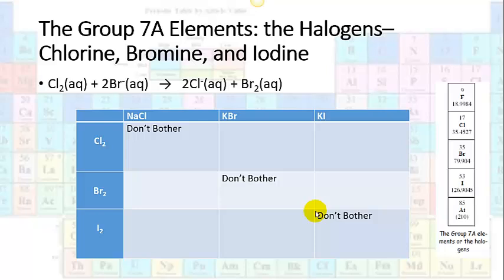So you will follow through with all of the different types of reactions that you see in your lab and follow along with your lab report form. When you get to the reactions of the halogens, I just want to point these out. I'm not going to go through each and every one. You're going to be able to determine the reactivity through your observations, but the halogens are tricky for folks. So I want to just spend a few minutes on what it is we're looking for and how you interpret what you see. So we're looking at chlorine, bromine, and iodine, and we're comparing the reactivity between these three to determine what the trend is.